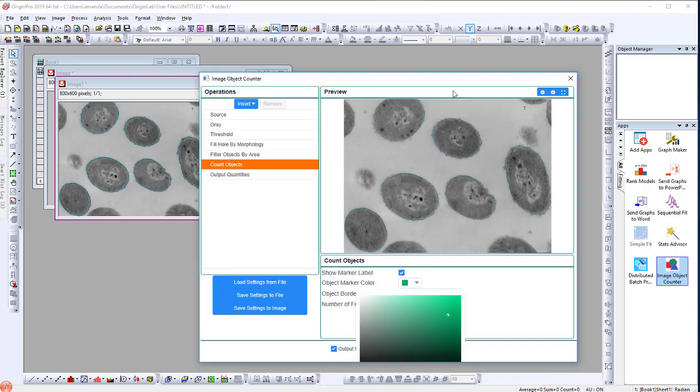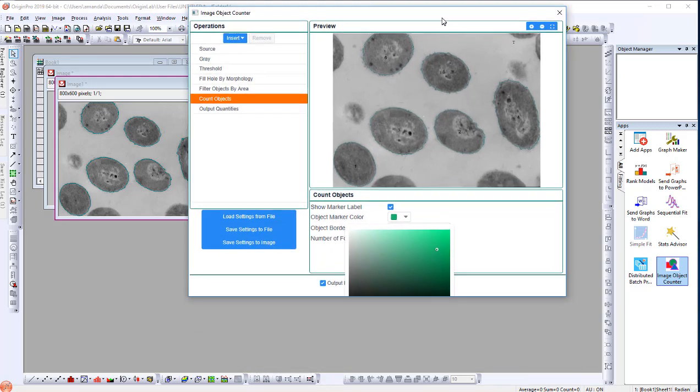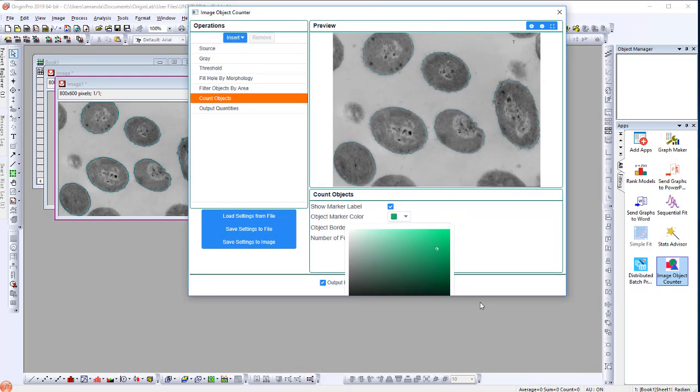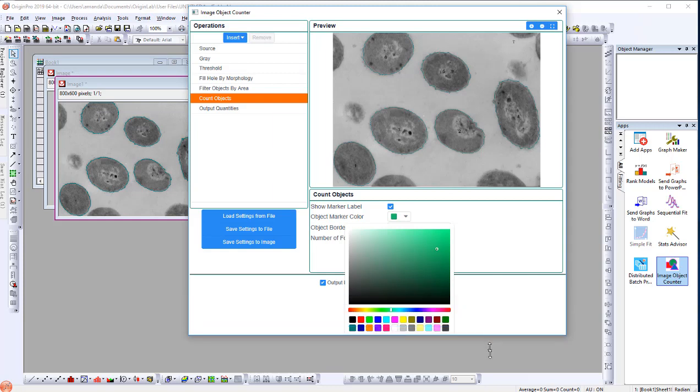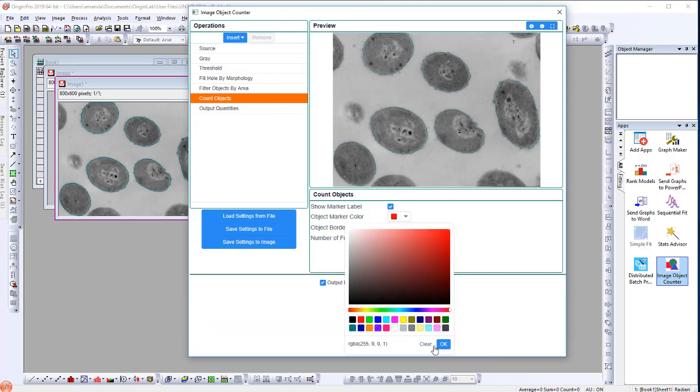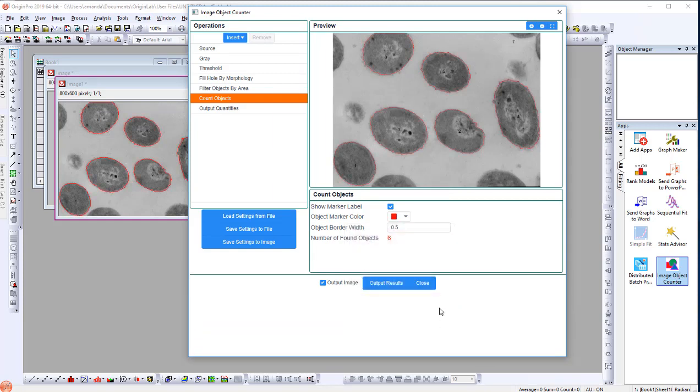To circle objects with red lines, change Object Marker to red and change the Object Border width to 3.